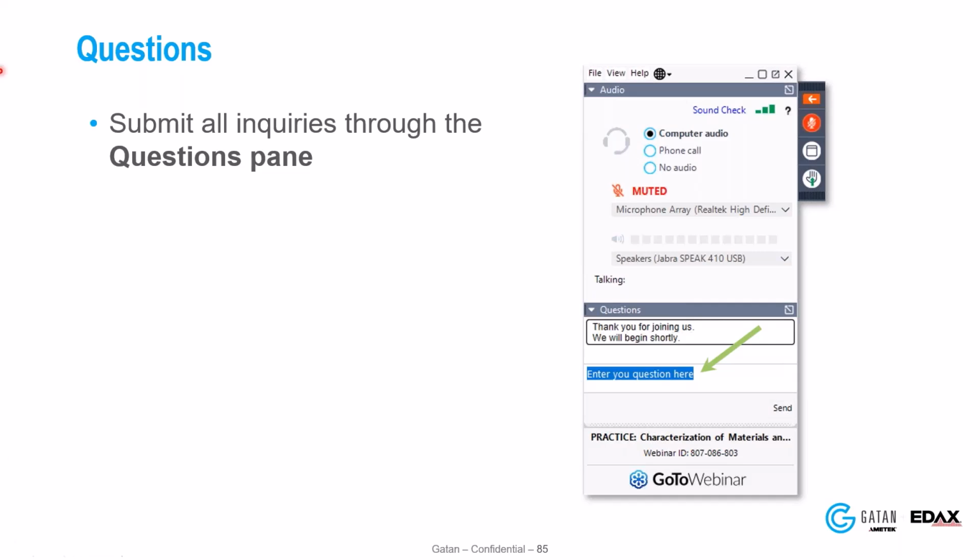Dan asked whether we have thought about running spherical indexing live, just to reduce the burden of having to reprocess the data and transfer it from point A to point B. I give the same answer as before: I imagine there'll be a webinar you can tune into in the not too distant future to learn more about it. Yeah, that's on our roadmap.